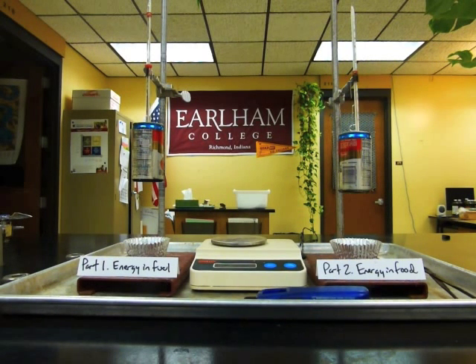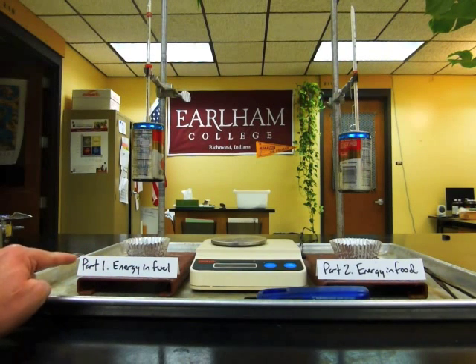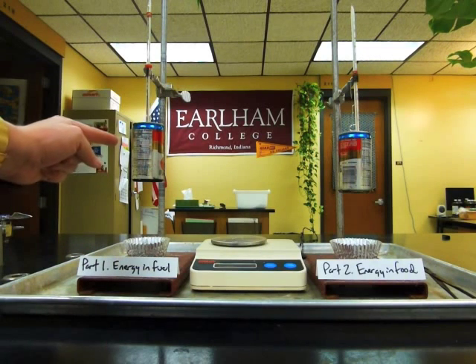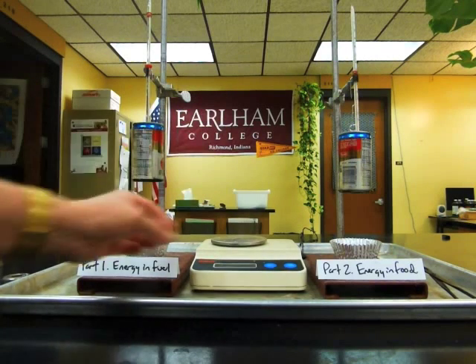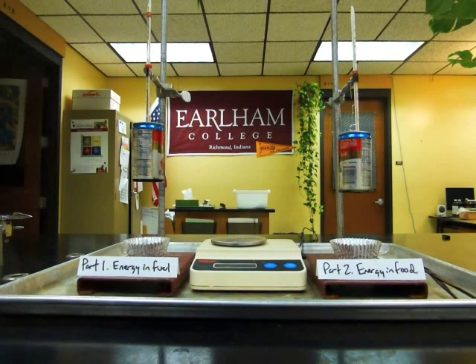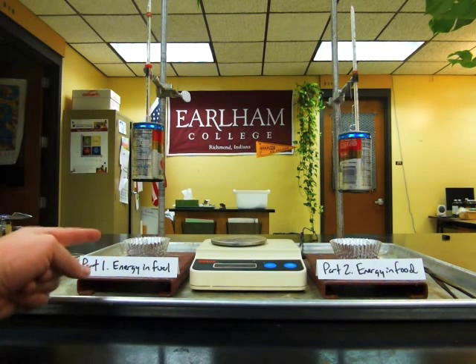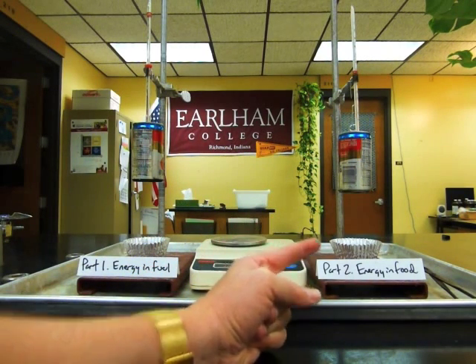We're going to start with part one, Energy in Fuel. I have a calorimeter here made from an open can, and I'm going to light a candle and try to trap as much of the heat in the can as I can. Now since this is an open calorimeter, a lot of the heat that I'm trying to measure is going to get lost to the room, so I know that the results are going to be rather inaccurate.